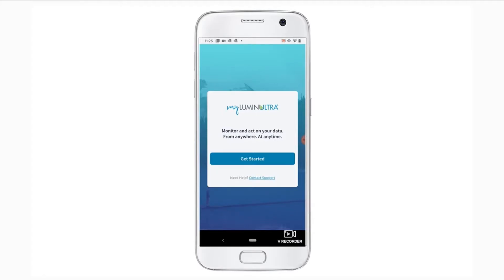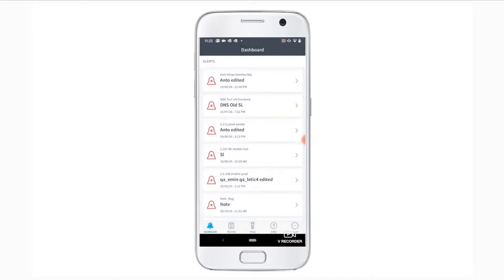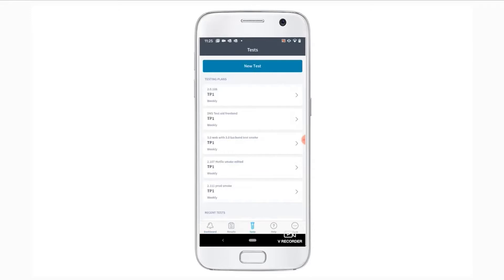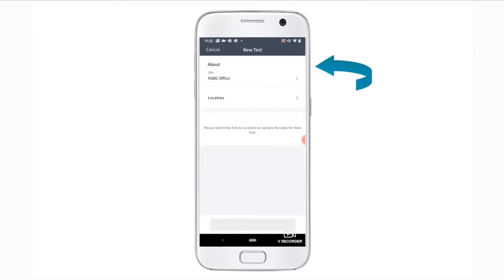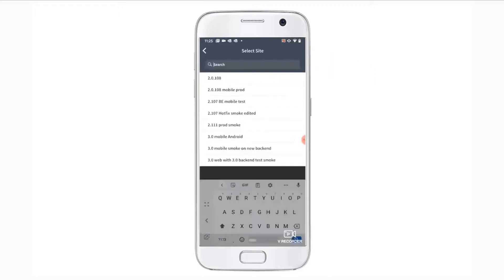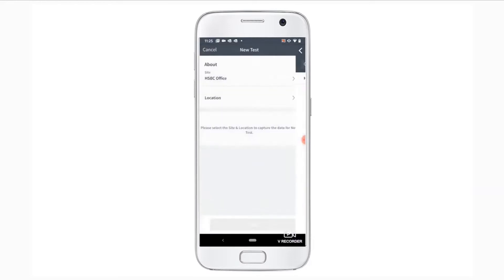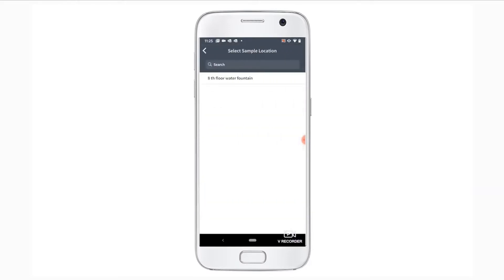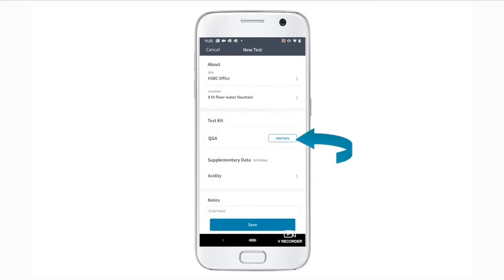When adding data to a sample location using a mobile device, first log in to the MyLumin Ultra app. Then, navigate to the Test tab at the footer of the application. Next, click the New Test button. Here you can select the site and sample location you wish to add data to. Once the sample location is selected, the Test Kit name will appear. Click on the Add Data button next to the Test Kit name.